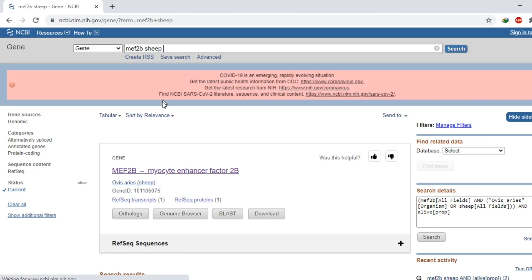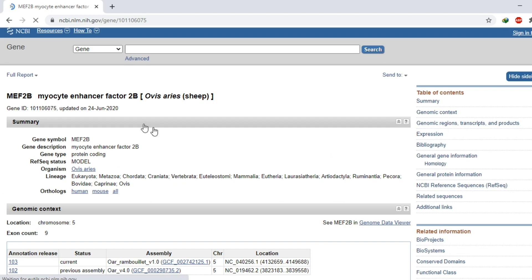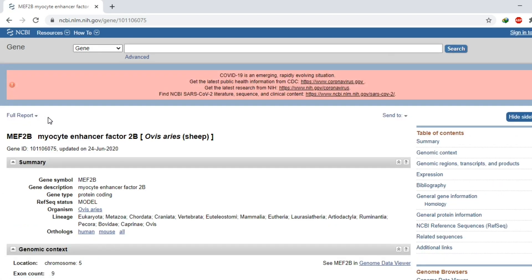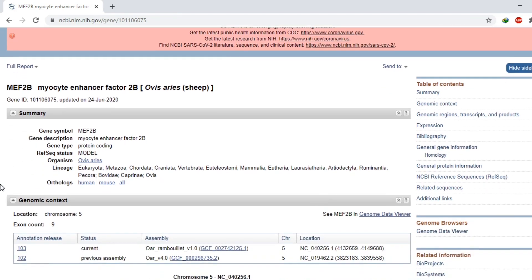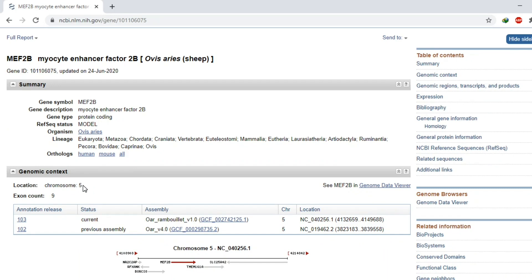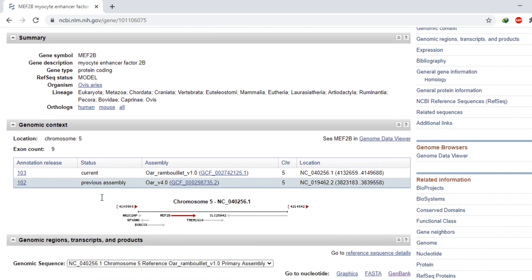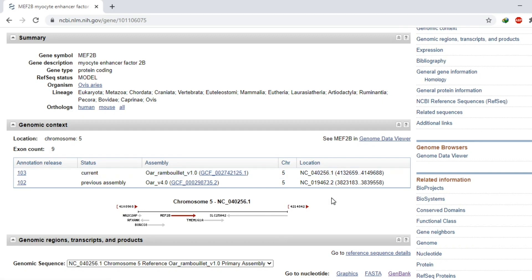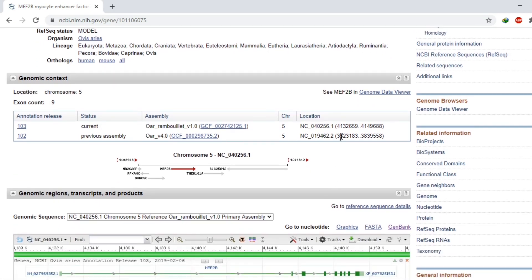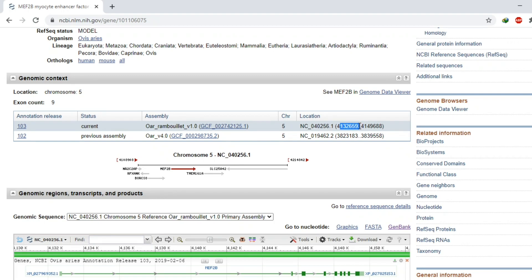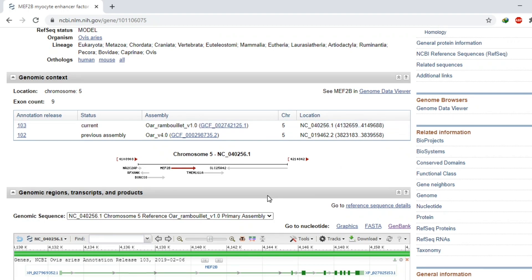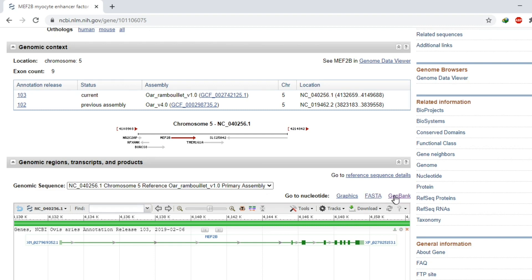Click on this link. Here is the full report of our MEF2B gene of sheep. This gene is present on chromosome number 5 and it has nine exons. Other details such as assembly are provided here. Its location is from these base pairs to these base pairs.